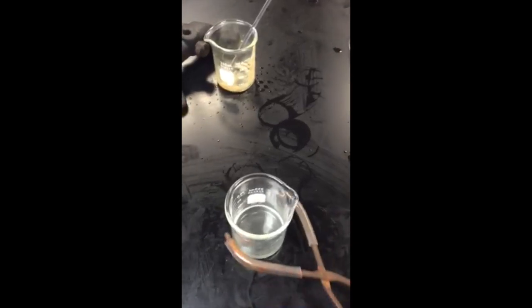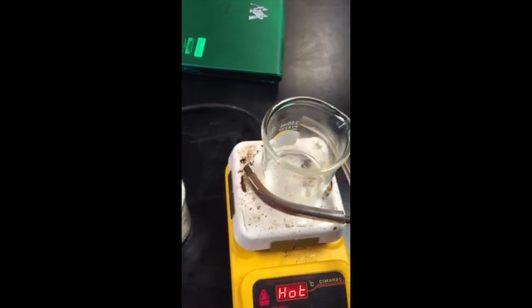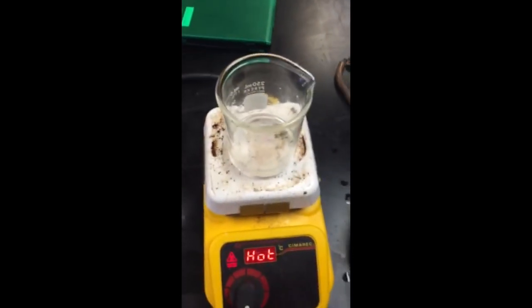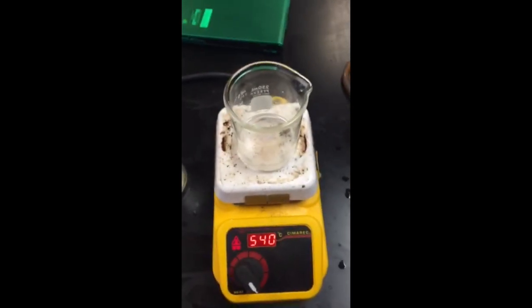Everything has filtered through and now we're just left with the salt water in this beaker. We're going to move it to the stovetop. We're going to place it on this heat top. Right now the heat top is off, and we're going to turn the heat on. We're going to wait for it to boil.